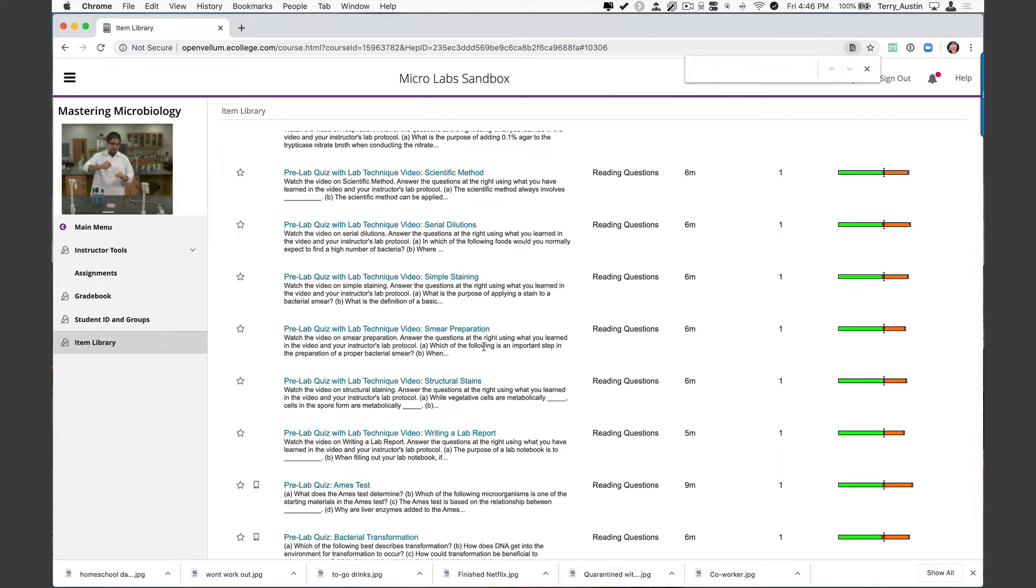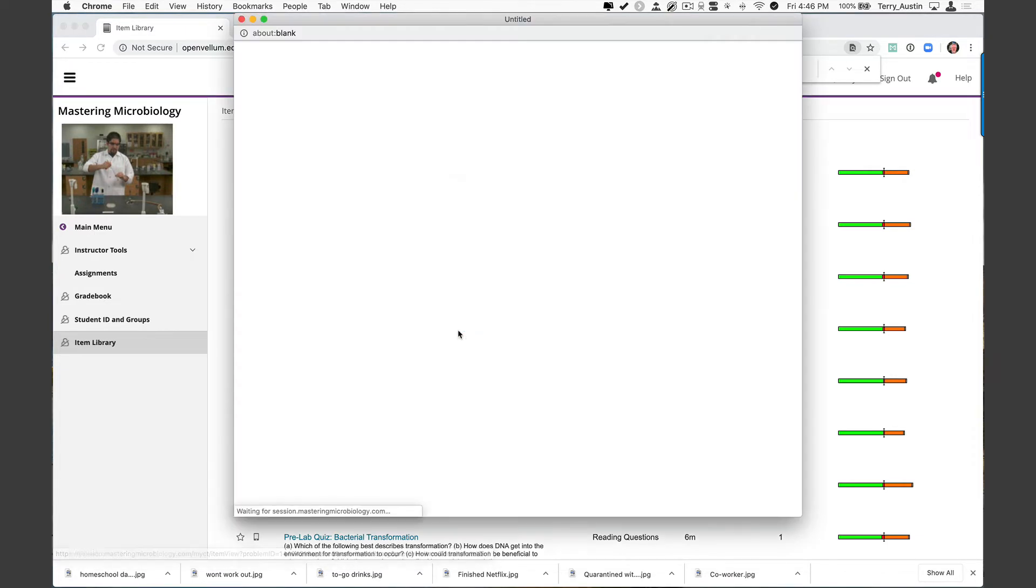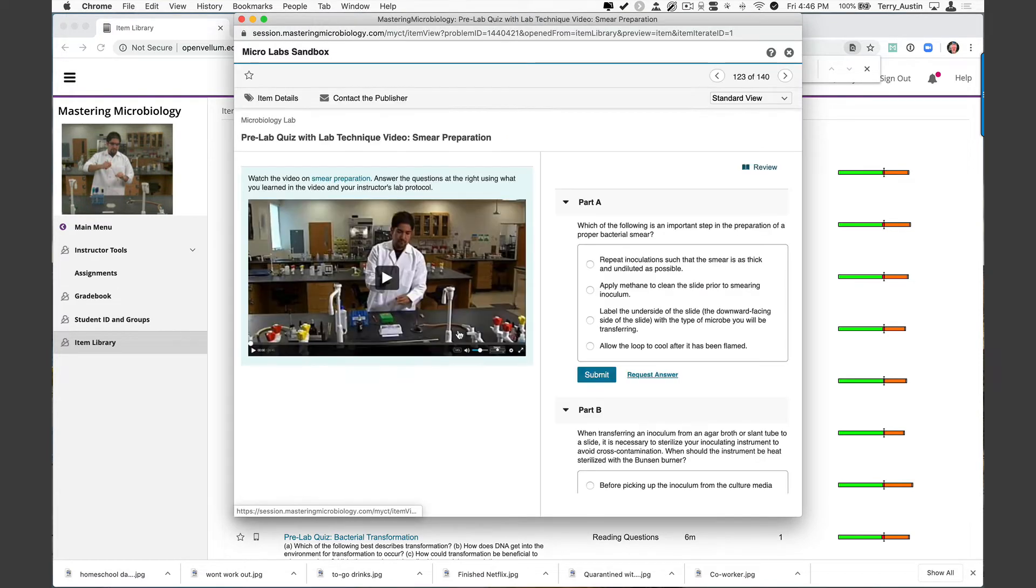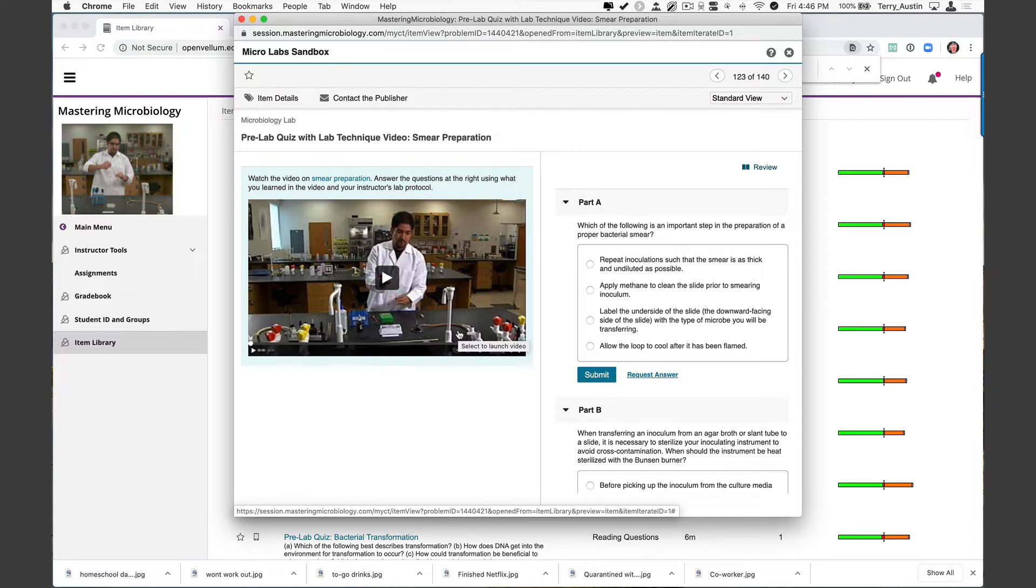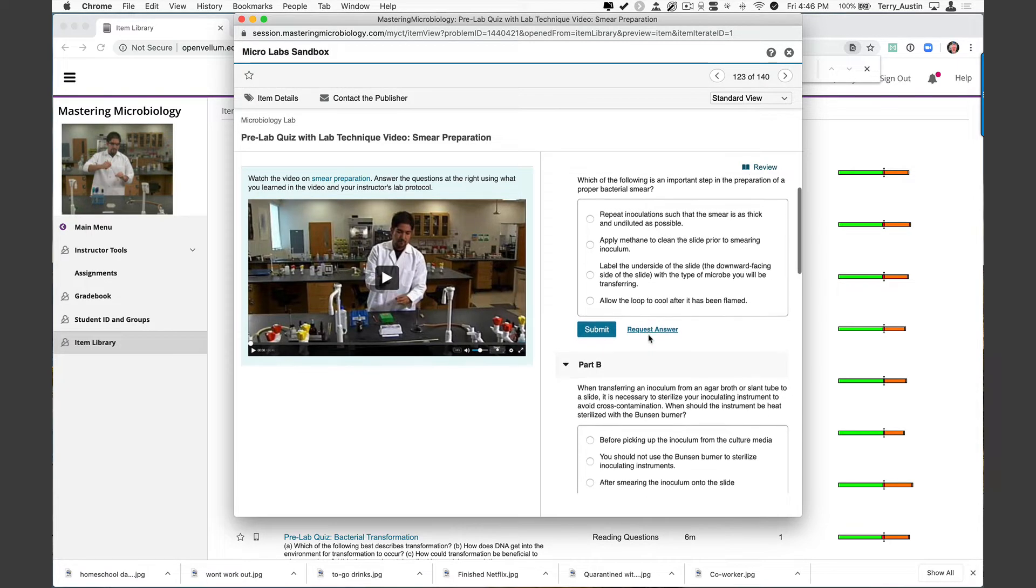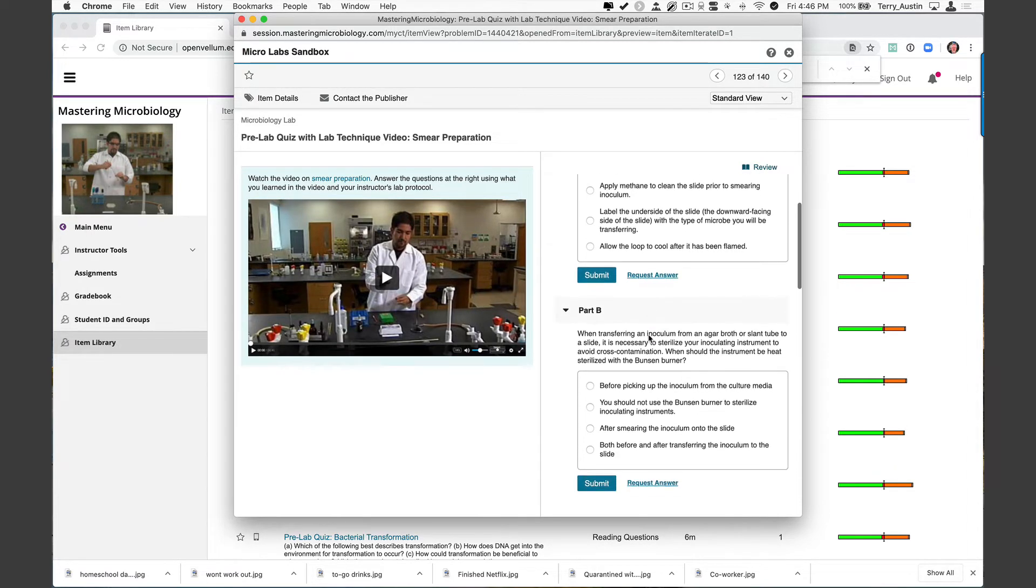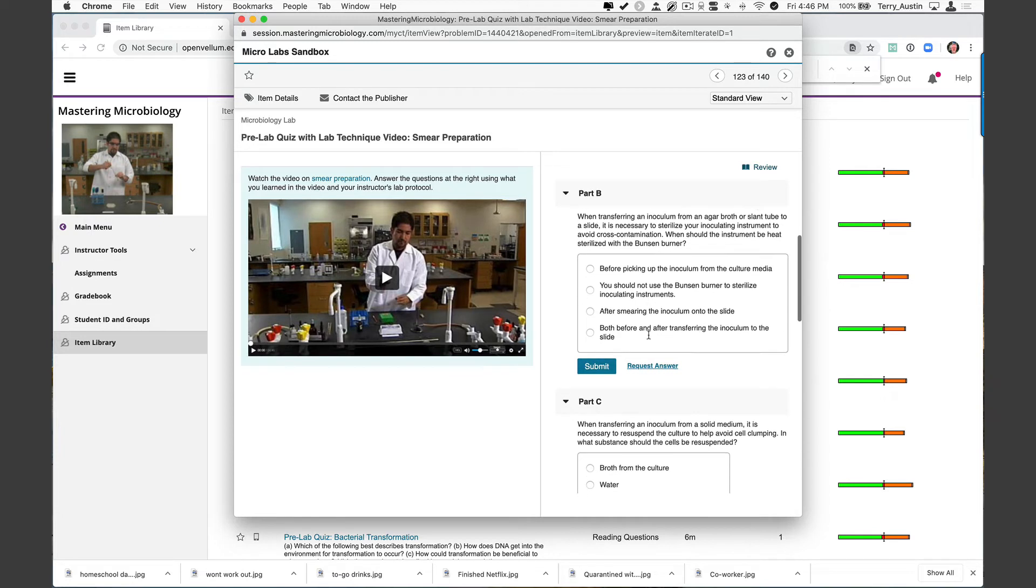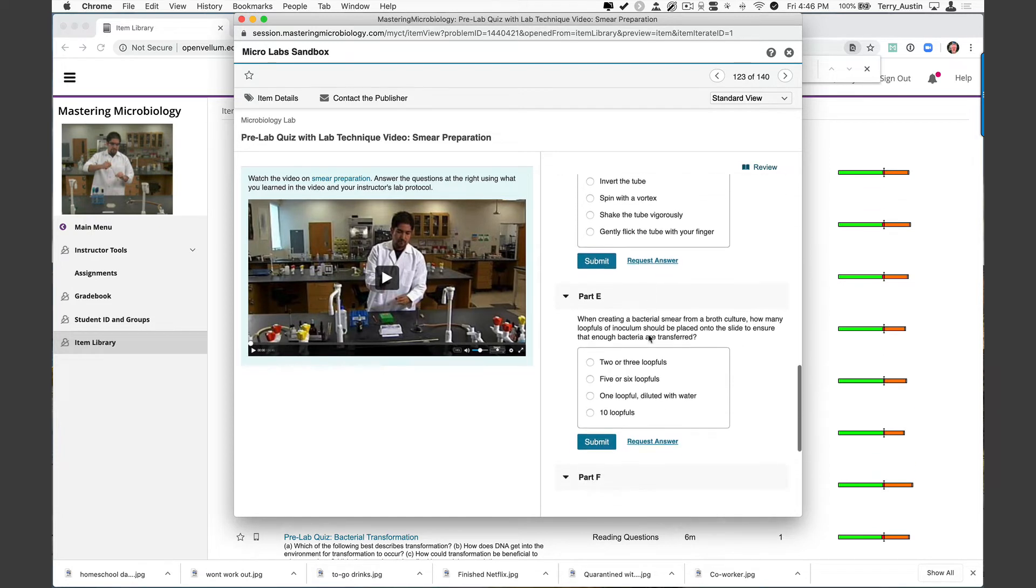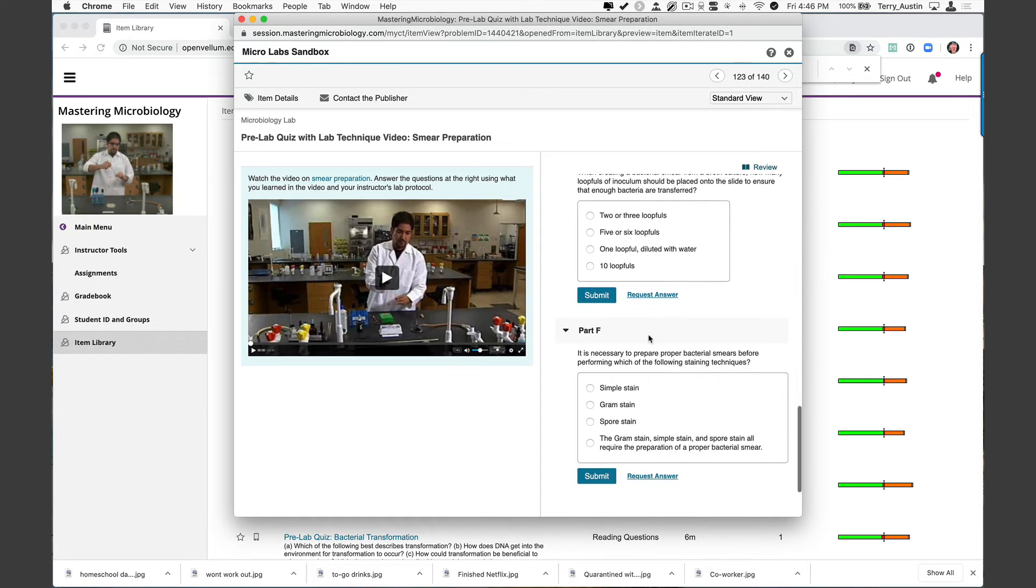Let me open one of these so you can see how they're laid out. I'm going to open smear preparation, which of course is the beginning of all good staining. As we take a look at the format here, we have a video on the left for your students to watch. And then I'm going to scroll on the right. We have one, two, three, four, five, six questions to be sure they really understand what they learned in the video they watched.